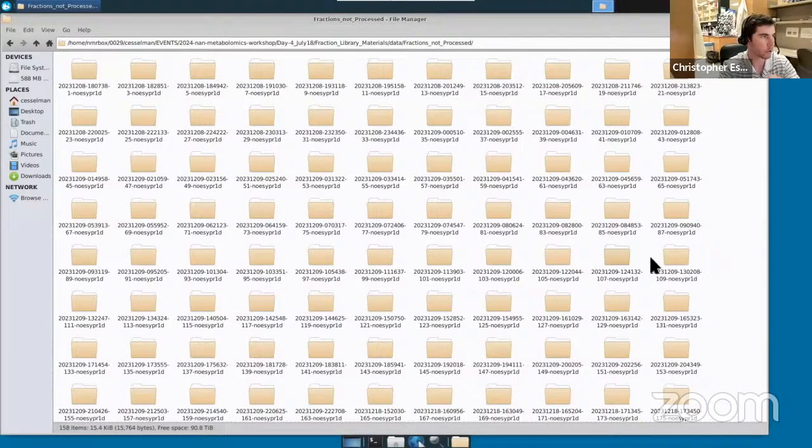So say you run an Icon experiment over a weekend. This is what I normally do: I just take 140 samples and I get something set up on Friday and I run it over the weekend. I just check in every maybe 8 hours or something like that to make sure everything's good. And it's little user intervention. You can just get all of these run quickly. And so after you go to the NAN portal that Mark Majeski talked about a little bit on Monday, you can download all of these directories here and get them into NMR Box where you can analyze them.